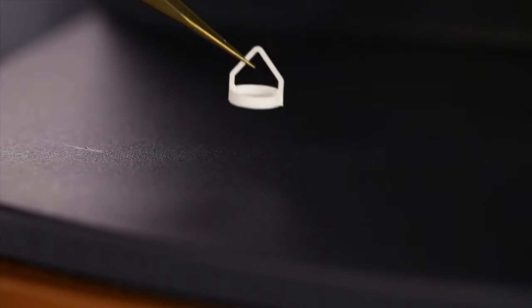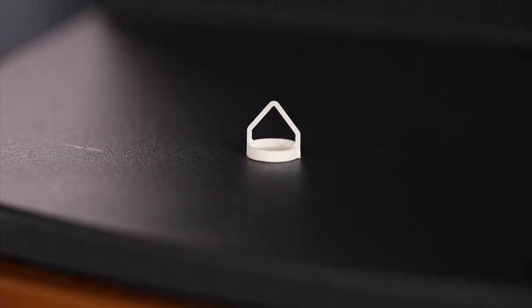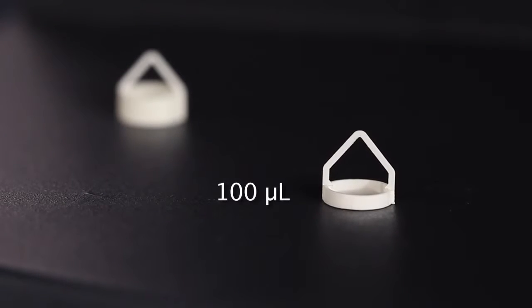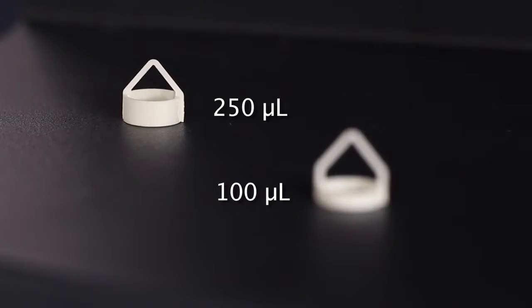Highly inert alumina pens are an excellent choice for aggressive compounds which may react with the platinum pens. They are good to 1200 degrees Celsius and come in 100 and 250 microliter sizes.